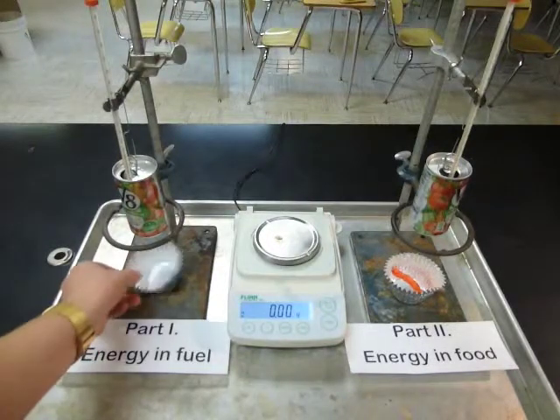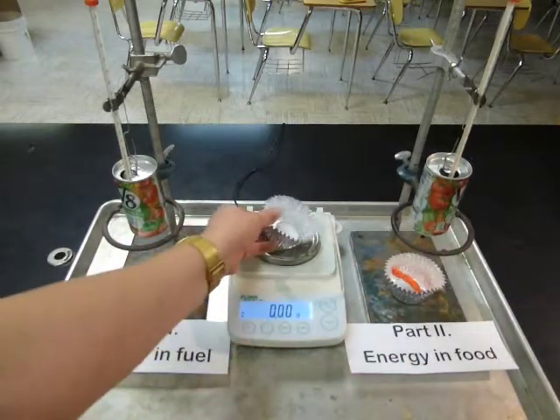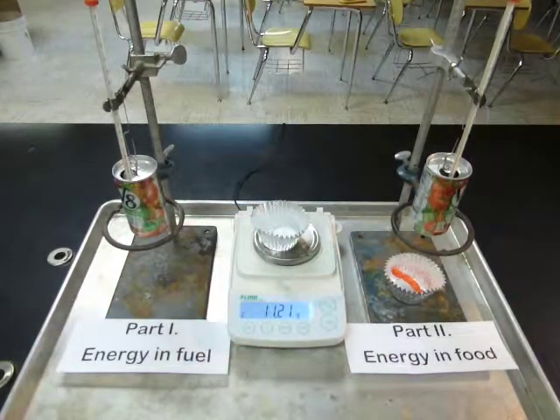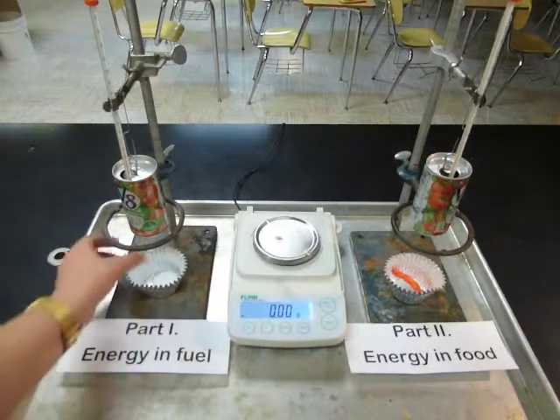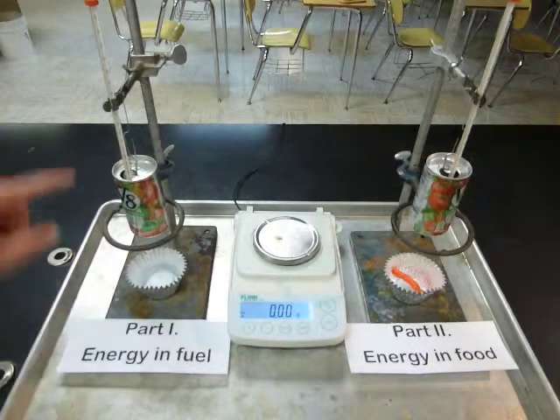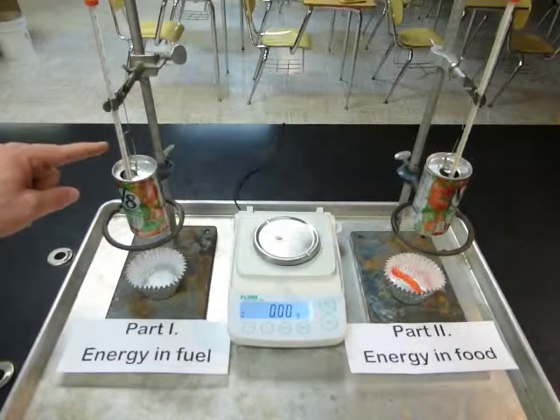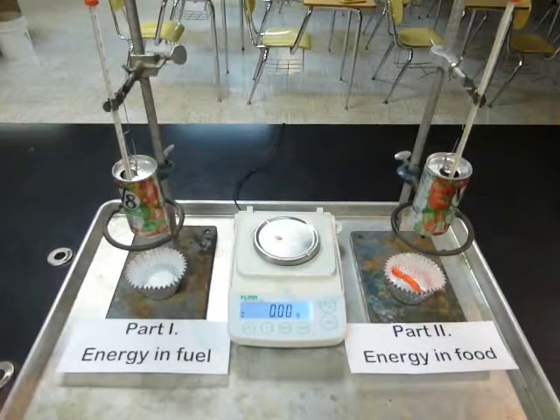First step, you'll have a baking cup and a candle, and you want to put those on the balance to find their mass, the starting mass of the candle. As it burns, the material is going to be used up and it should weigh less when we're done. And then we'll put that down, and when you're ready, let me know. I'll come by and light your fire. But first, make sure that you read the starting temperature of the water inside the calorimeter and record that.